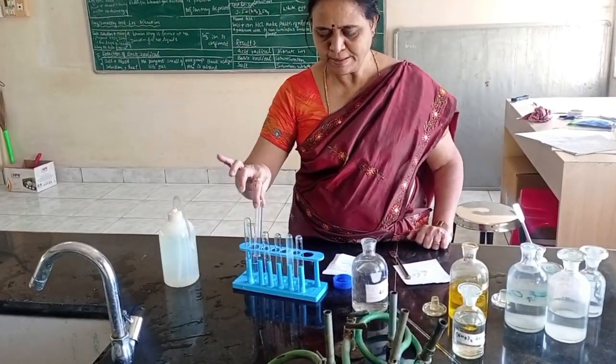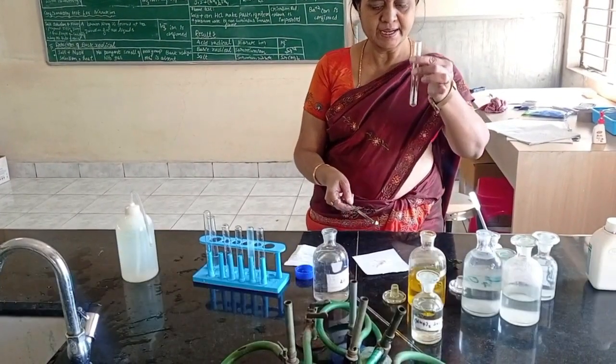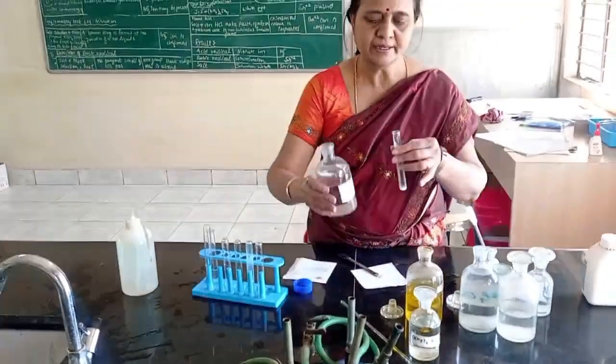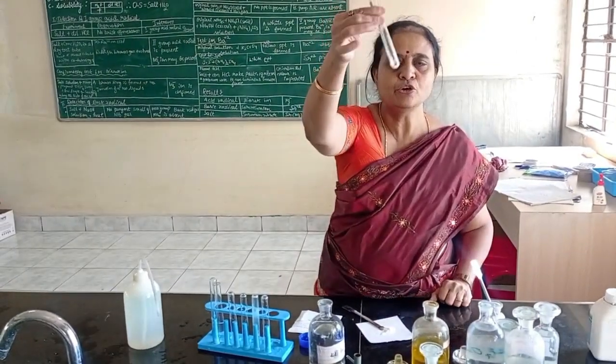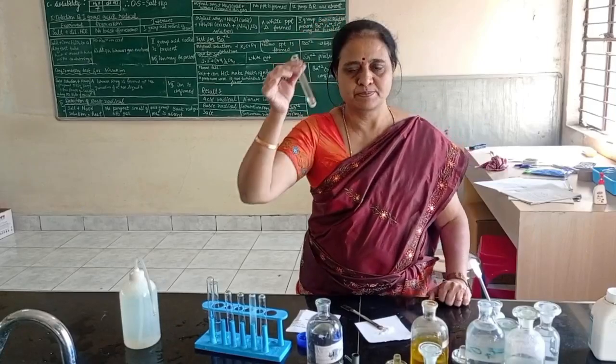Detection of first group acid radical. For first group acid radical, I take salt and I am adding dilute HCl. Salt plus dilute HCl. See here, no reaction, no brisk effervescence. First group acid radical is absent.